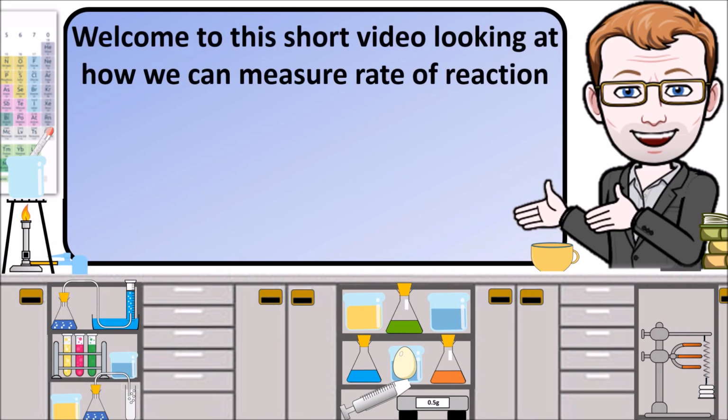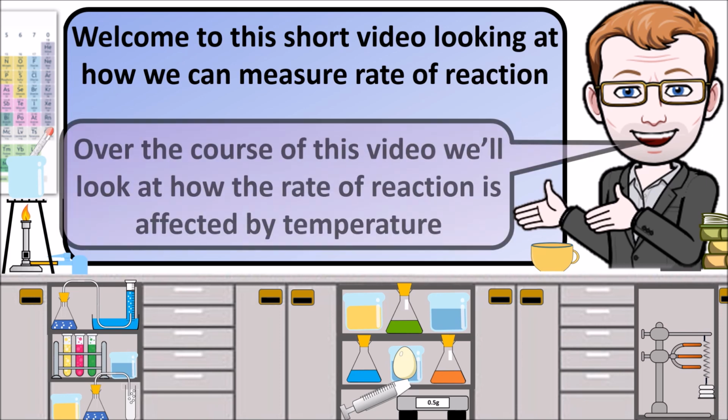Welcome to this short video looking at how we can measure the rate of reaction. Over the course of this video, we'll look at how we can measure the rate of reaction and see how it is affected by changes in temperature.